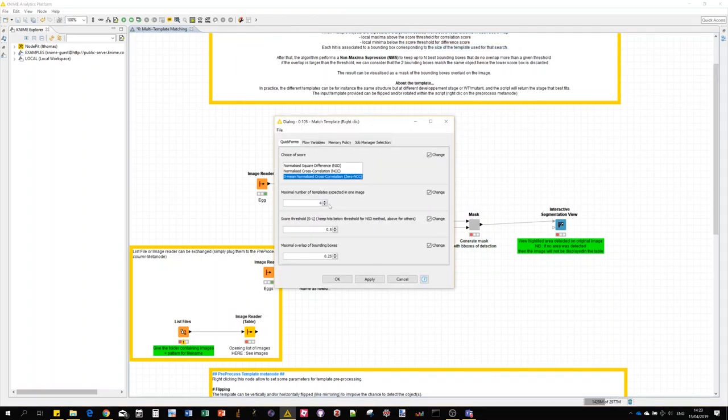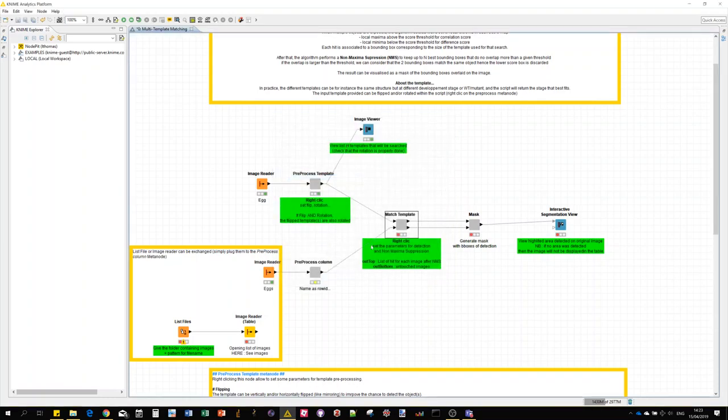This time I expect four objects in each image and the score threshold of 0.5 and 0.25 for the overlap is still fine. Let's run it.